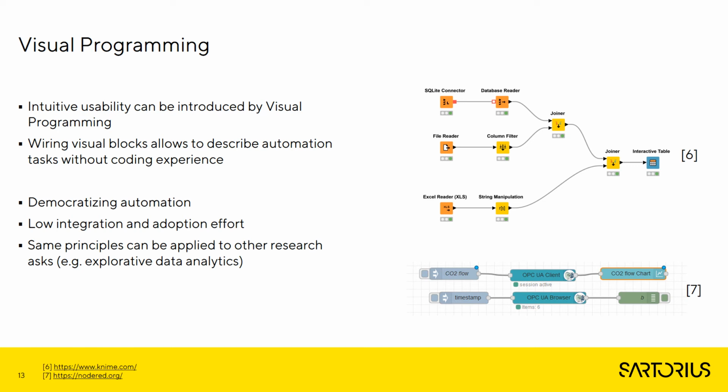Visual programming allows non-software engineering experts to create complex workflows without using actual code by providing graphical components with a dedicated functionality. These components can be composed to finally form an entire workflow of data manipulation, charting, or automation processes.